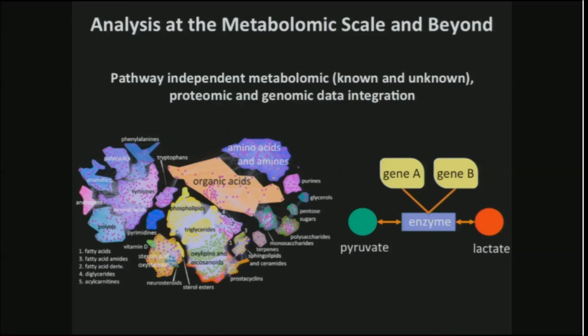One thing that showed is that as you're adding all of these different ways of connecting your information, you're giving a context to everything. The various relationships, structural similarity, mass spectral, they all have weights. So you would go on to build a network, and in this network, you could map the strength of the relationship, how much you believe it, maybe by the thickness of the line. So you would orient yourself among the network to things which you believe less or more, given the data.